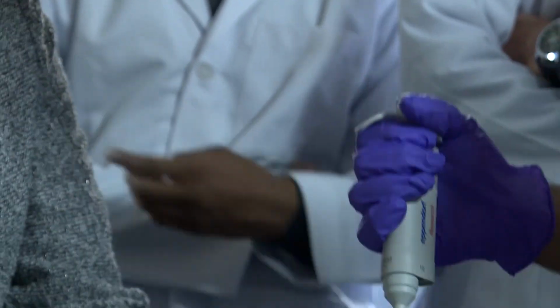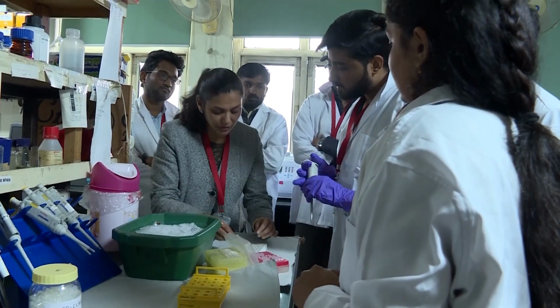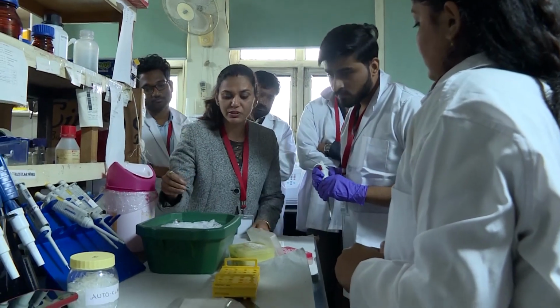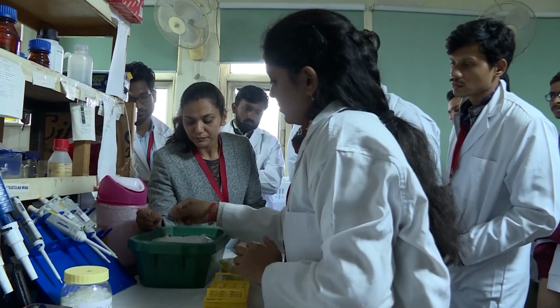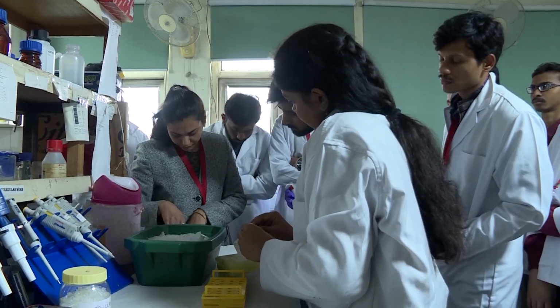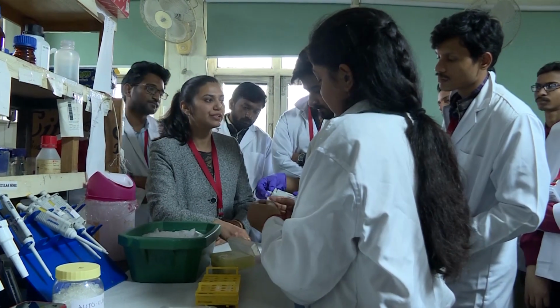Now we have to add cDNA. Last step, template addition. All things are added. Now this is the control, this is the addition. This is the control cDNA. How much cDNA do you have to add? 2 microliter in each. So 2 microliter of cDNA we will add.